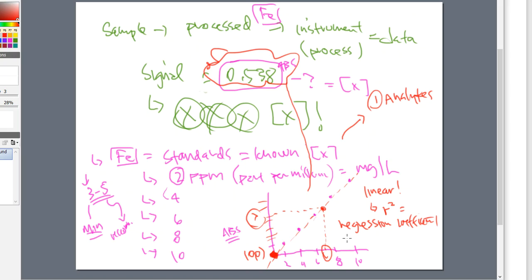All right. So number 1, it's got to be done with every analyte. So that means if my method has more than one analyte, I will end up with more than one calibration curve. So for instance, we do a lab on honey, and honey looks at 4 different sugars. Well, all of those sugars should have their own cal curve, every single one of them. So I'm going to make a set of standards that have those sugars in them. I'm going to run them. I'm going to build a cal curve for each sugar. So that way, when I run samples, I can take the information from each of those sugars that it sees and plug them into the proper calibration curve to make this thing work the proper way.